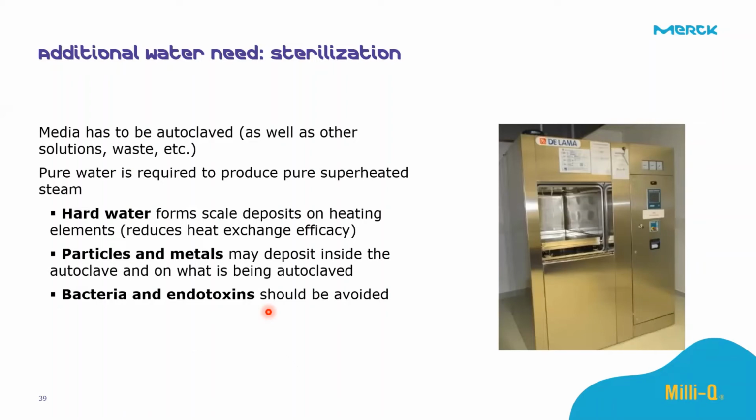This is because hard water will form scale deposits on heating elements, so reduced heat exchange. We also have particles and metals that may deposit inside the autoclave and on what is being autoclaved, and bacteria and endotoxins should be avoided.